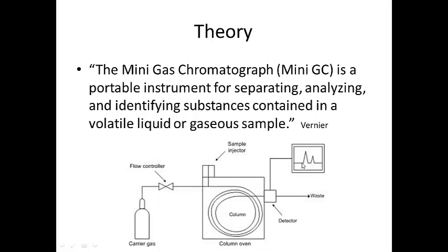And the chromatogram has a baseline when the detector does not see anything, doesn't detect any solvents coming off, and then it will give a peak when it does. And the peak, the time that it takes the peak to come off is called a retention time, and the size of the peak depends on how much the detector is detecting. So we can use gas chromatography for qualitative purposes, meaning what is it, and quantitative, how much. We're just going to do a qualitative lab this week.